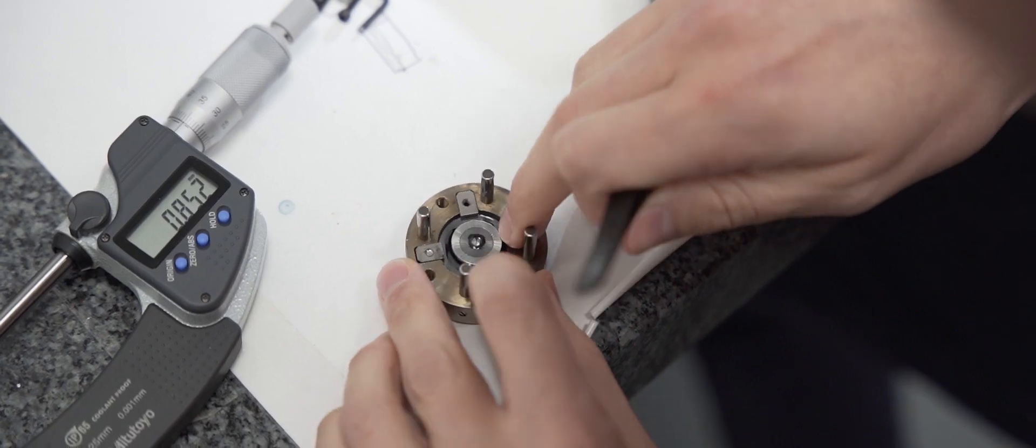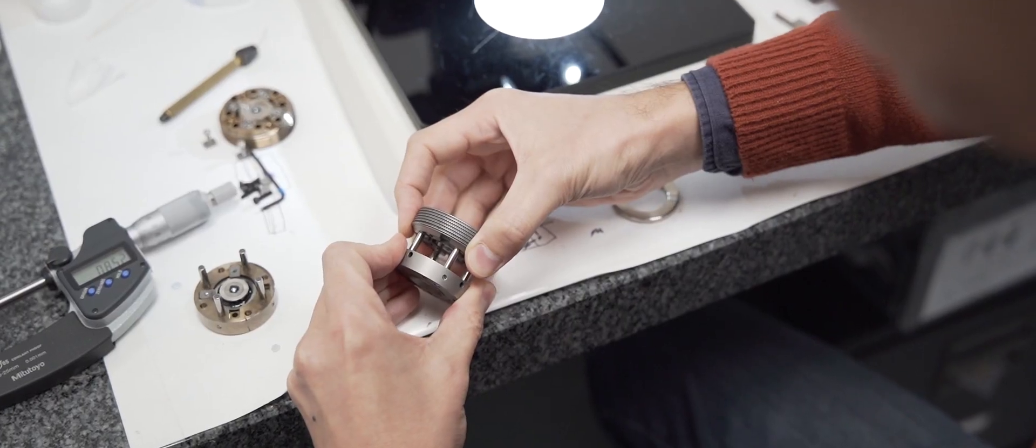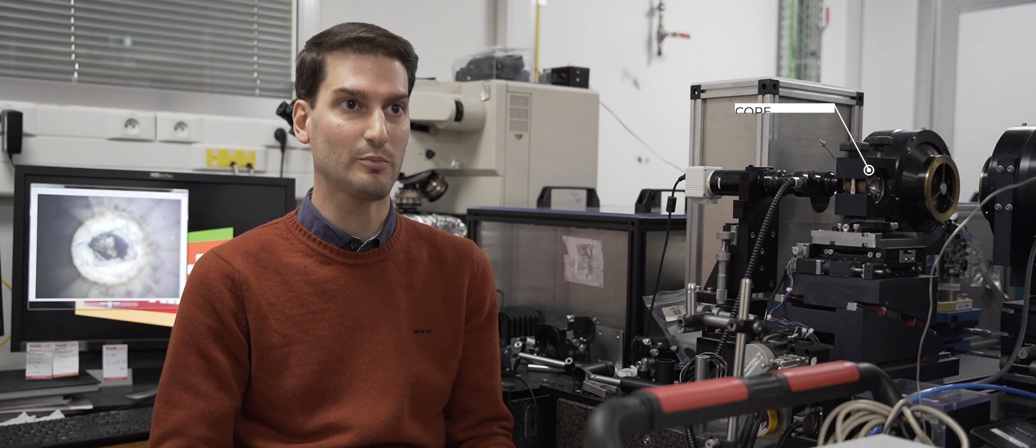Another activity of the Smith beamline is the study of materials at very high pressure, where very high pressure means thousands or millions of atmospheres. We're able in the laboratory to generate pressures which are of the same order of magnitude as what we have inside, for example, our planets.